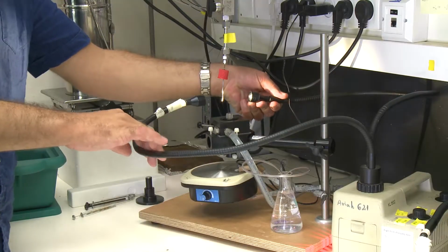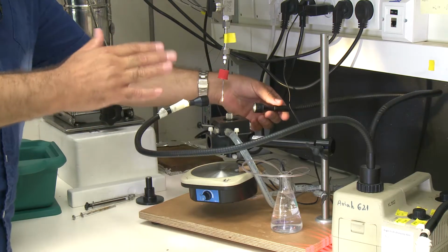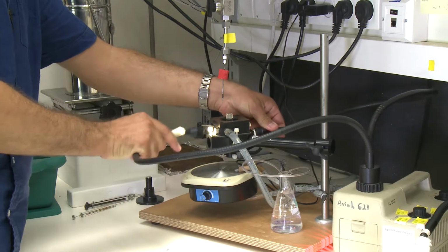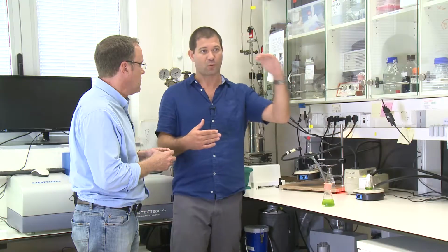Now, in real time, while we are changing the light intensity, we can observe how the rate of oxygen production depends on it. If we have a lot of light, we will see a high rate. If we have low light, we will see a low rate. And if we do not have light at all, we will see respiration. The oxygen won't stay steady, it will go down because of respiration.